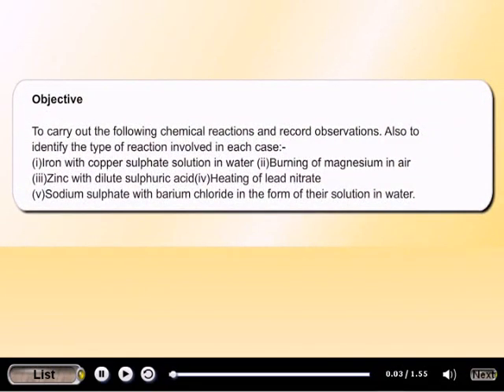Objective: To carry out the following chemical reactions and record observations. Also, to identify the type of reaction involved in each case.